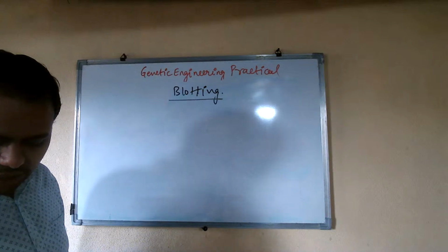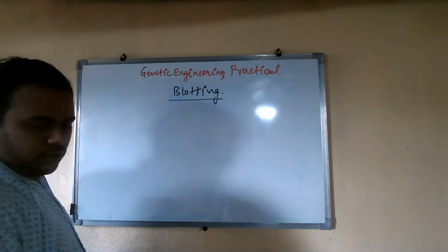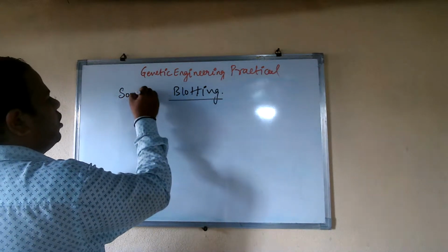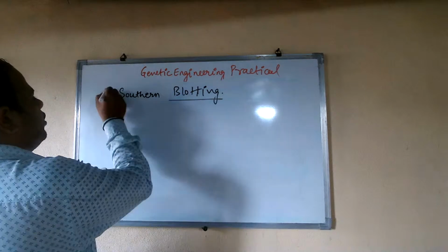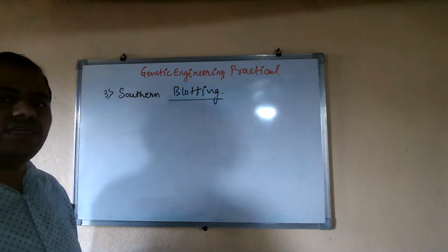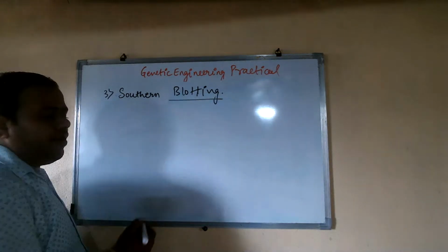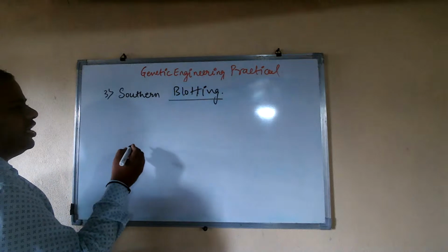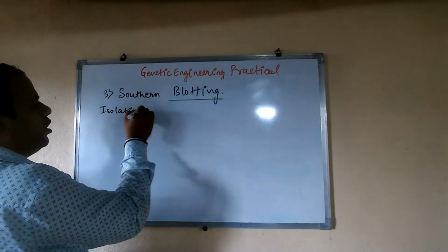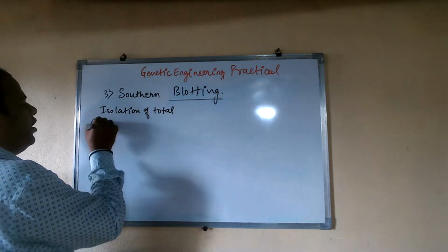So let's see the next one, that is Southern blotting. Okay, so in Southern blotting, the whole process is the same. First of all, I will enlist the steps. The first step is isolation of total genomic DNA.